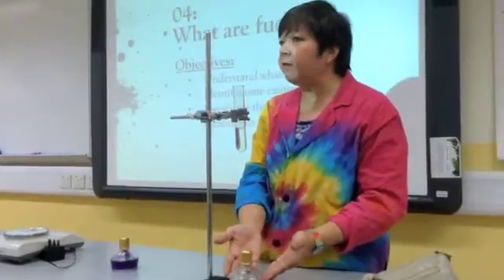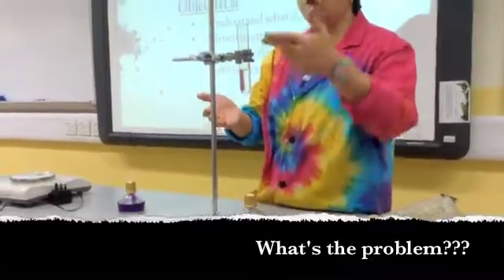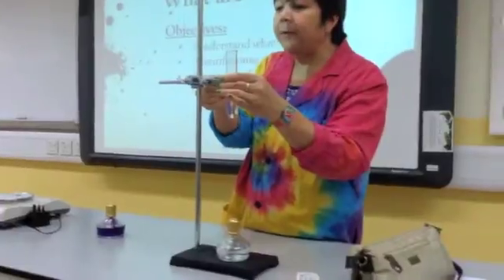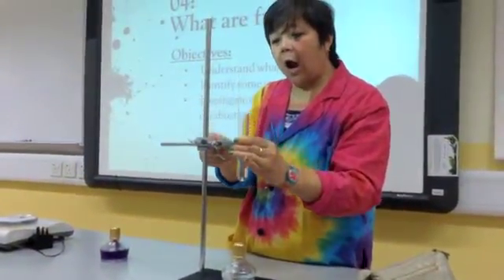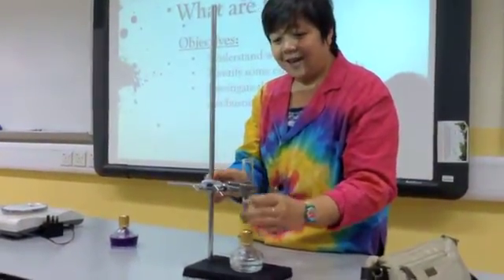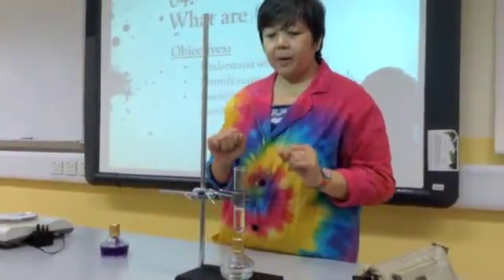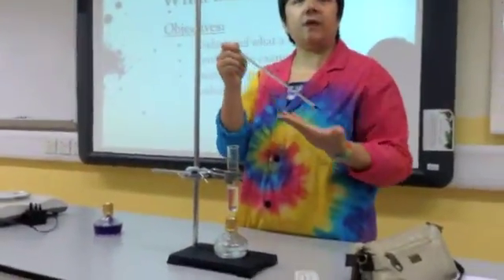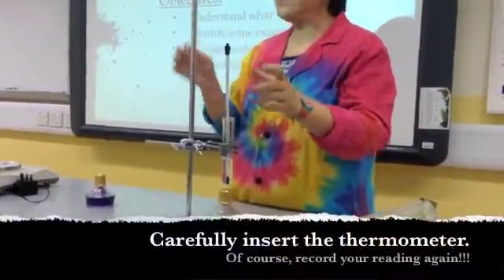So we put the ethanol over here. What's the problem? It's too high. So what do I do? I loosen the clamp and I can lower it. Now, this is the most important part: we're going to use a thermometer because you have to get an initial reading.